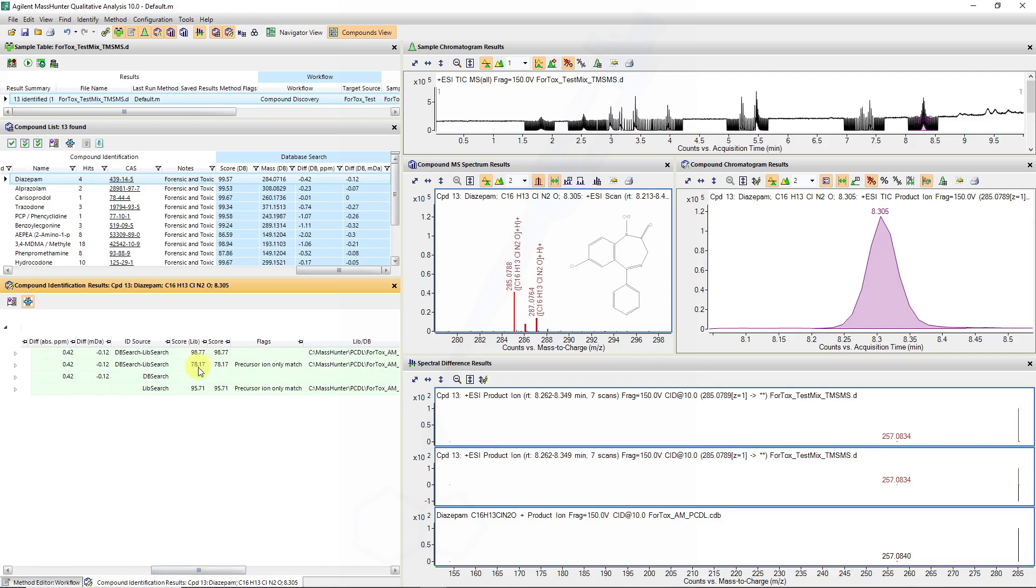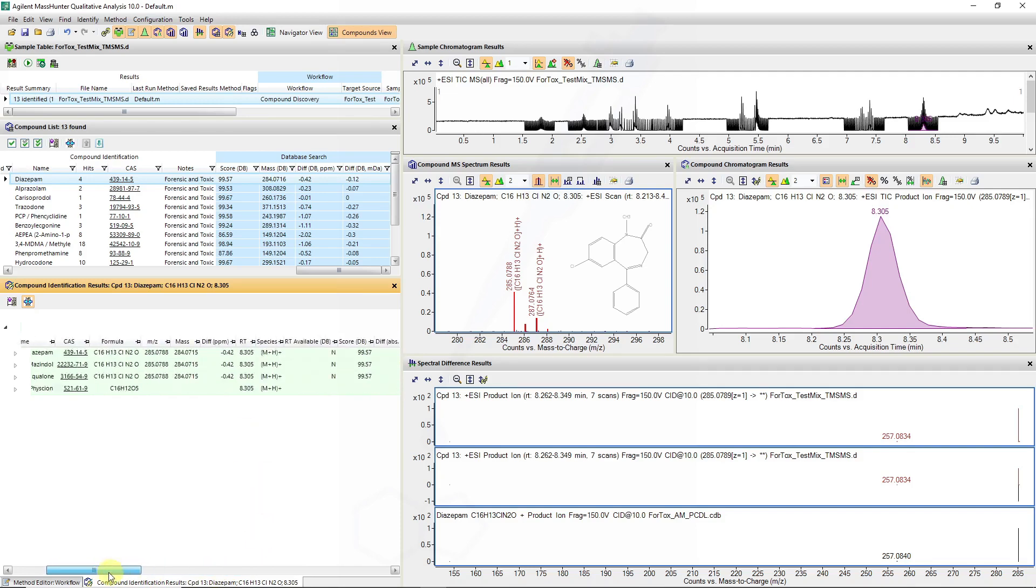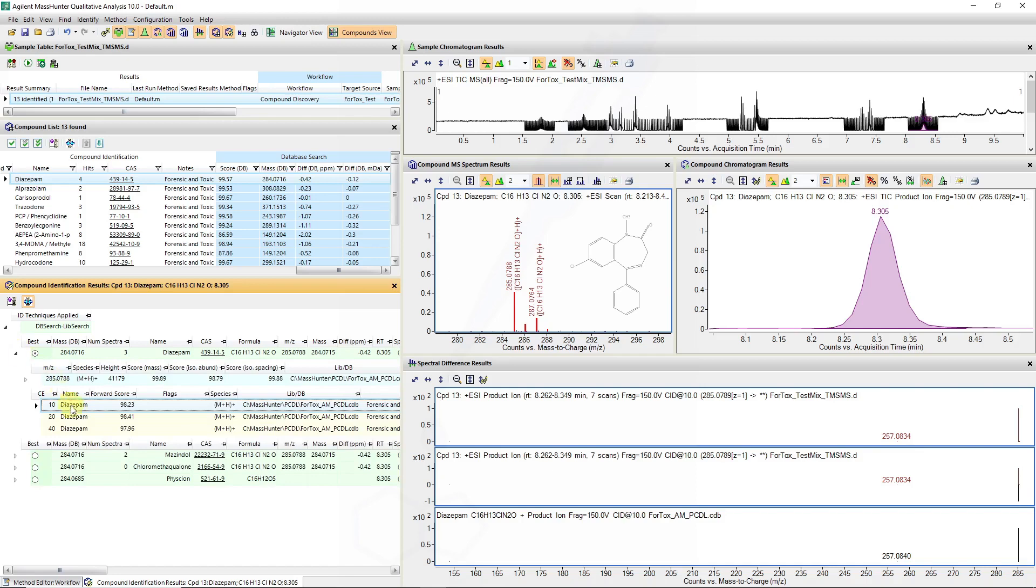You can see the mezindol has also scored but the methqualone chloromethqualone didn't have any scores associated. So if we expand this tab then we can see that the forward scores for diazepam at different collision energies were specified.